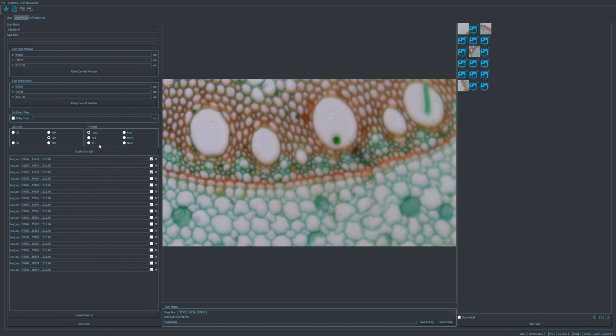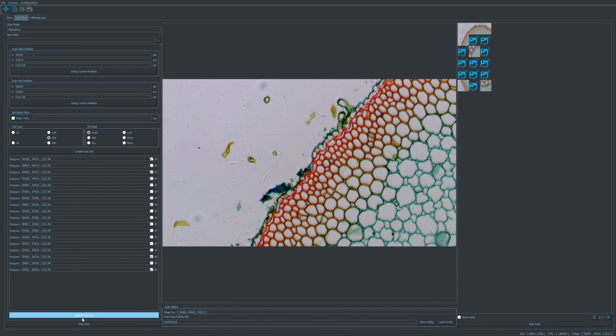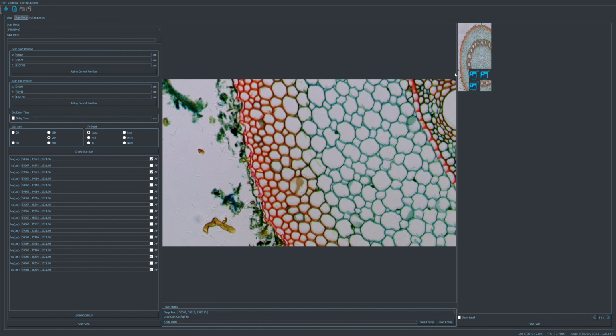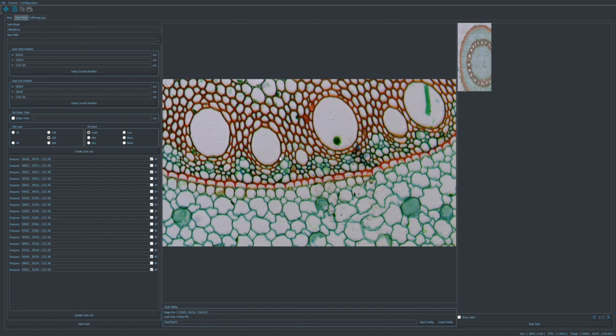You can either do none, you can choose least, you can choose middle size, you can choose all, and it will select all of these, and you can do the scanning. You can see that. And here basically it scans and fills out this area. Once this is done, it stitches these images together. And you remember we selected these 2 points here, and then we can also save this configuration and load it later if we need it.